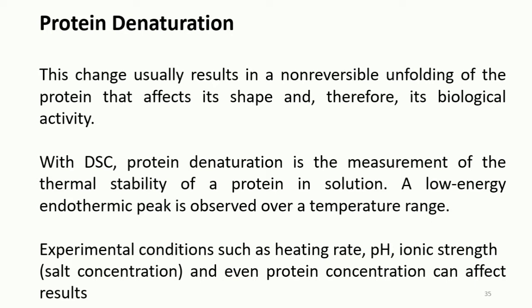Experimental conditions such as heating rate, pH, ionic strength, that is salt concentration, and even protein concentration can affect results.